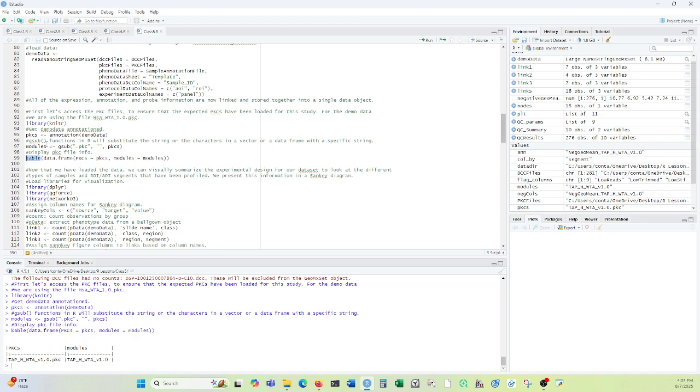And this is once again the function to make tables, little tables that you can see inside your module. Very useful for R Markdown and things like that, but it's there to see things. Never actually useful for programming.